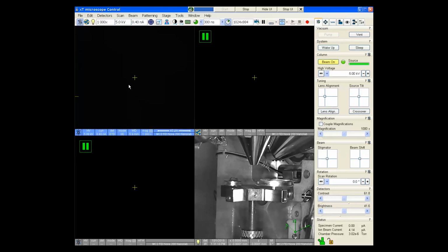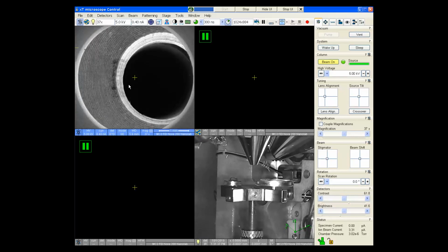My suggestion for this type of situation is to first lower the magnification of the microscope to the minimum value that it is capable of going to. This can be done in a variety of ways. On the manual user interface, the large knob in the center is the magnification knob. This can be turned clockwise to increase the magnification or counterclockwise to decrease the magnification. We just want to spin the knob counterclockwise until the image stops changing magnification.